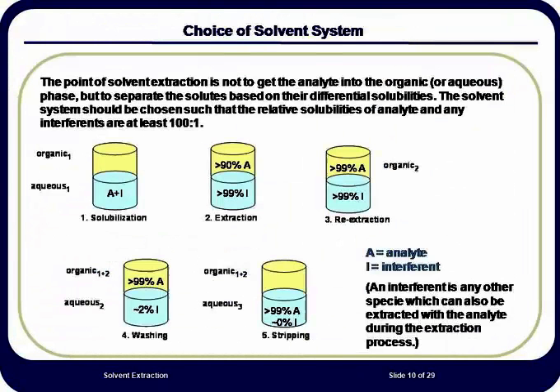Most methods that use solvent extraction have used a trial and error approach. The exact nature of the complexes formed and the conditions for their formation and extraction are not nearly as important as the fact that certain combinations of solvents and chelating agents provide the largest differences in the extractability of one radionuclide over another. This slide represents pictorially what we have described as the 5-step solvent extraction process.